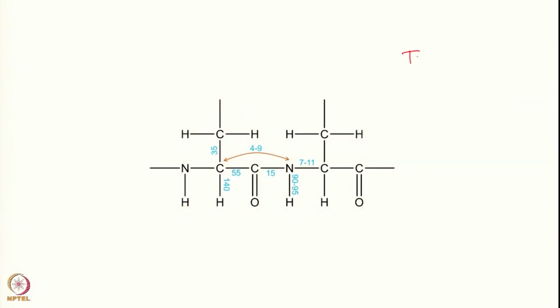Yeah, so you can see that the triple resonance experiments are basically driven by application to proteins. In fact, this has been an extremely useful feedback system: multidimensional NMR experiments were developed, but the proteins actually drove them very strongly. So the desire to obtain structural information on proteins has been the motivation for developing newer and newer pulse sequences, and you will see that all these triple resonance experiments which we will describe are primarily directed towards proteins, and therefore we will be concentrating on that.